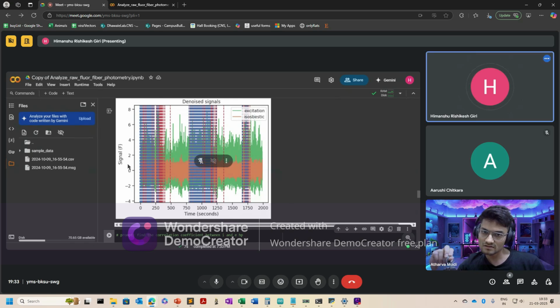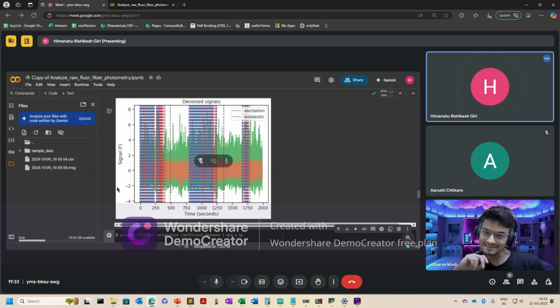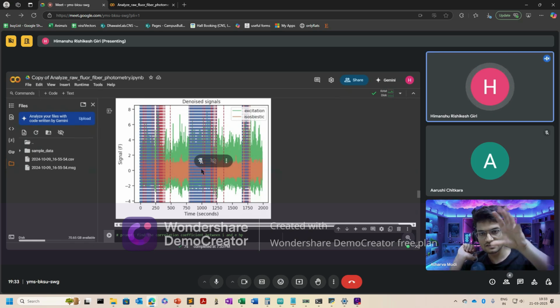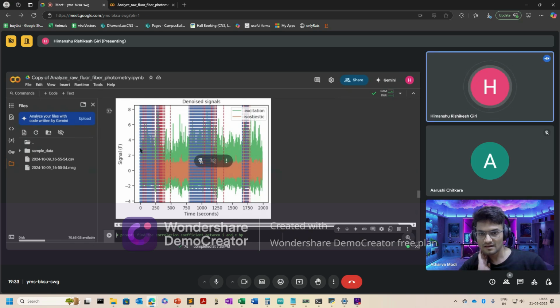then you could probably sense that whenever there is large movement, you see that the width of the green portion reduces when there are no behavioral events. Overall, it increases when there is movement. So overall, yeah, it is shallower.